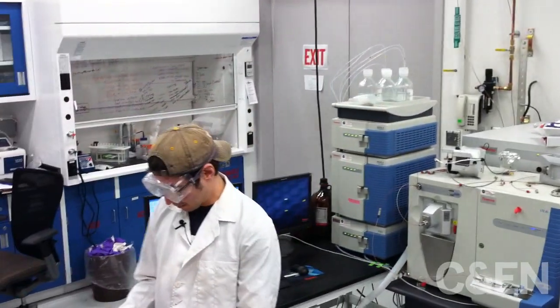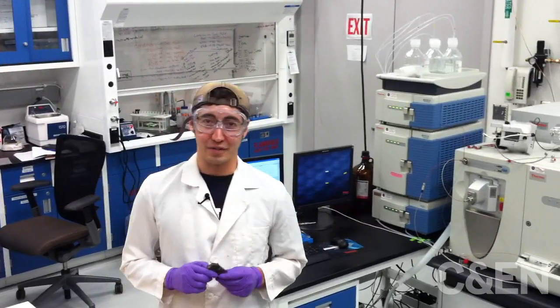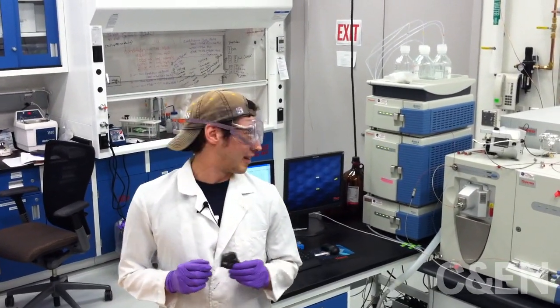Today I'm going to show you a little bit about the procedure that we use to analyze these types of materials in the laboratory.